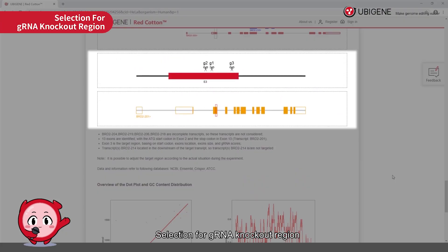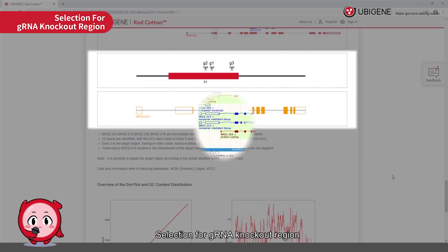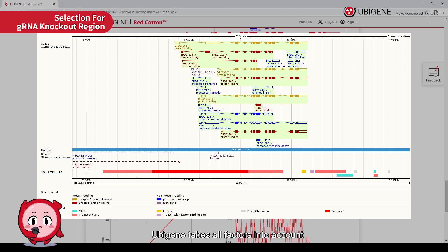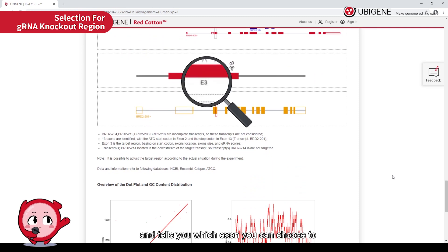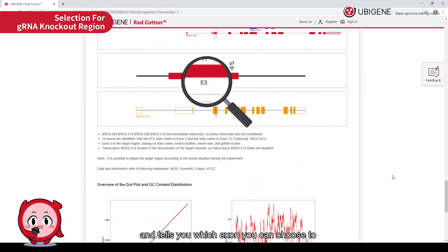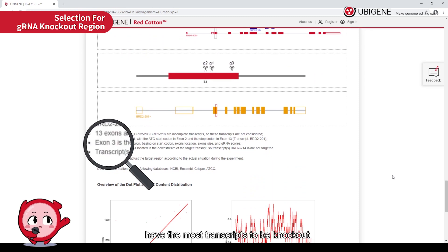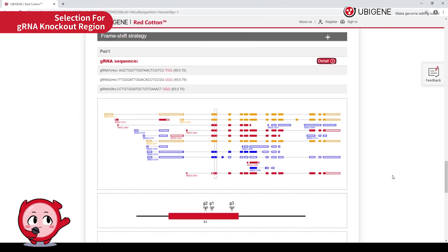For gRNA region selection, combined with Ensembl and NCBI databases, UBGene takes all factors into account such as the positioning and size of transcripts, exons, and coding regions, and tells you which exon you can choose to have the most transcripts knocked out, as well as the best knockout effect.